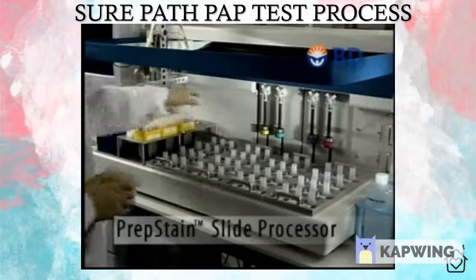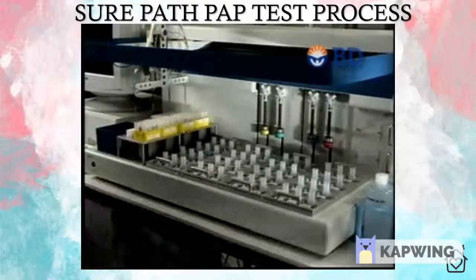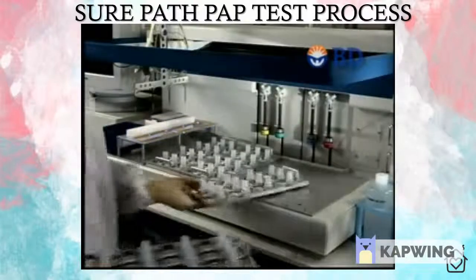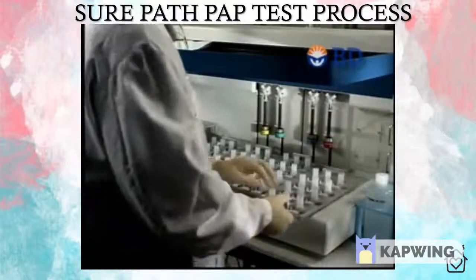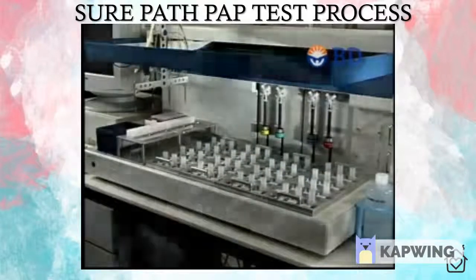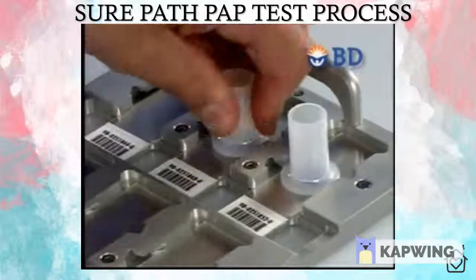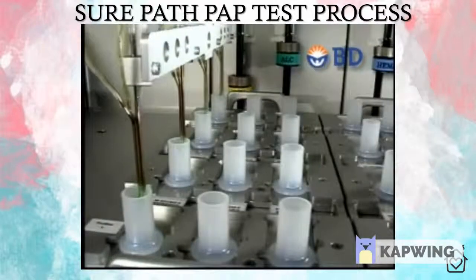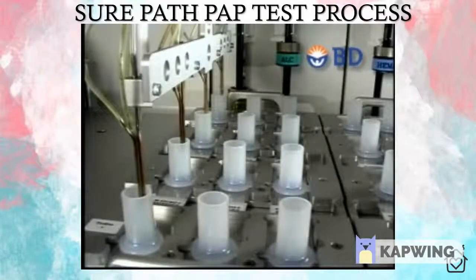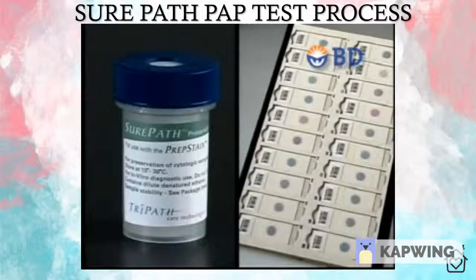Centrifuge buckets containing tubes are loaded directly into the PrepStain sample area. Labeled slides are placed directly onto the PrepStain slide processor, which can hold up to 48 slides per cycle. All tube and slide racks are keyed and can only be inserted in the correct position. Disposable settling chambers attached to the slides define the 13-millimeter cell deposition area, where thin layer preparation and discrete staining are automatically completed. Multiple slides can be generated from one specimen if desired, which is useful for non-gynecological specimens and repeat testing.